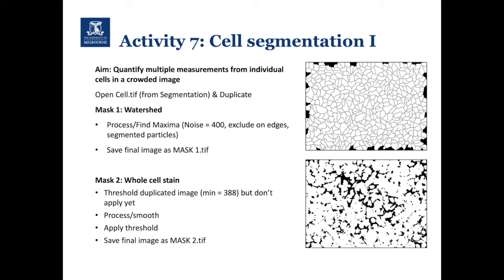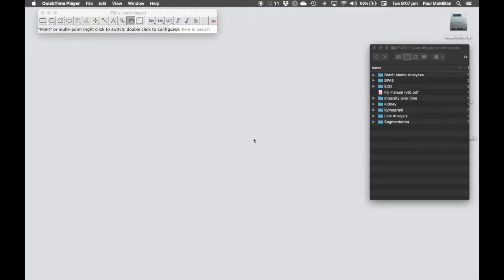on in the analysis. The cell segmentation activity can get very complicated. There are lots of different steps, so I advise that you follow this sheet as best as you can. I'm going to take you through the steps just now.